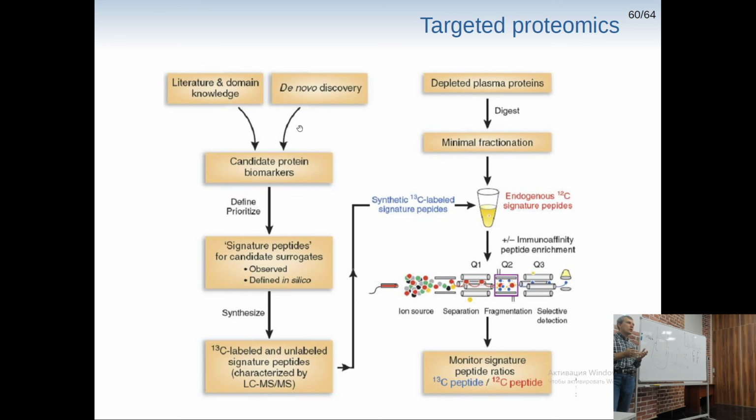This is so-called targeted proteomics, when you already know what you're searching for, and even with the use of a triple quadrupole, which is quite easy to use, you can get the concentration. Of course, you can use Western blot or something, but what if your protein of interest is in some attomolar concentration? Western blot is no option, right? Here, the sensitivity of this approach is quite high because you are hunting just one mass and you don't need to scan anything. You just select some precursor, you fragment it, and you select just one fragment that has this arginine and the one that you are actually hunting for.